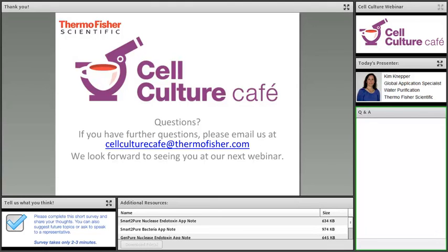So if you disinfect the system and install the old cartridge back in that potentially could have bacteria, you could easily reinfect the system. So it really is a good choice to start fresh every year.